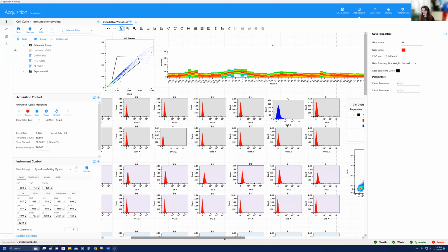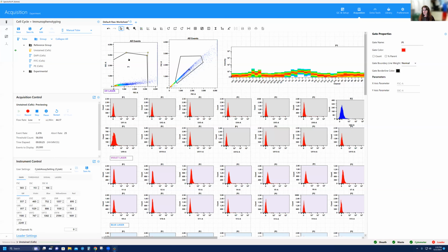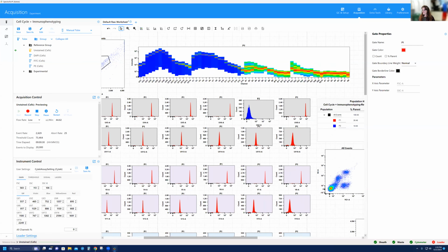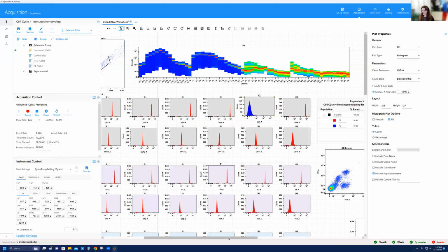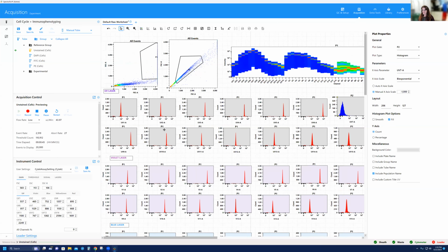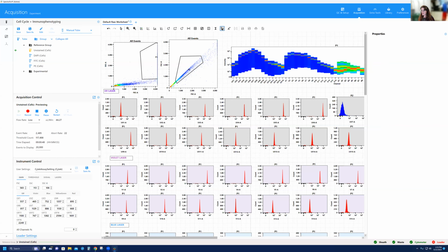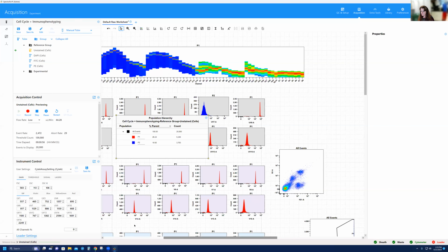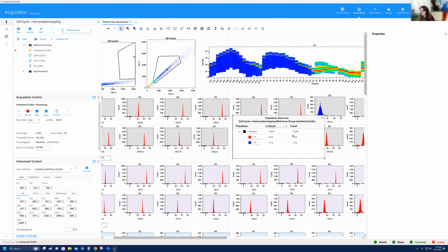I don't expect that. So where is my staining? If I bring that over here, oh, look at that. We see some profiles that we would expect for FITC, for PE, and absolutely for DAPI, right? So what I'm trying to do here is make sure that I'm pulling out where my cells are. You also have the capability to add in, through that option here, the population hierarchy, which already existed and I just hadn't seen it. And the P1 is 26%. So that's 26% off scale.